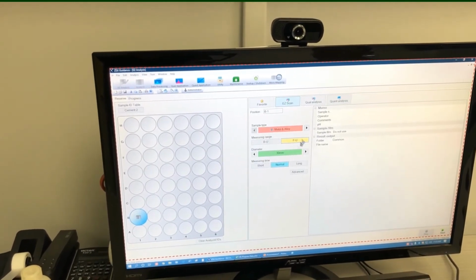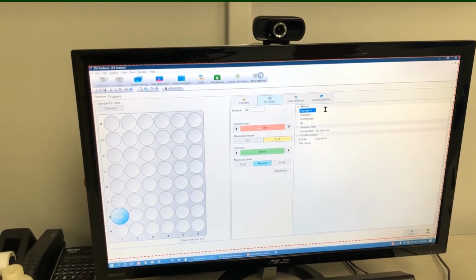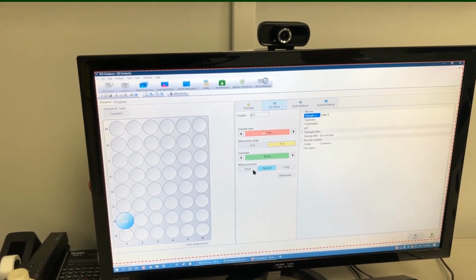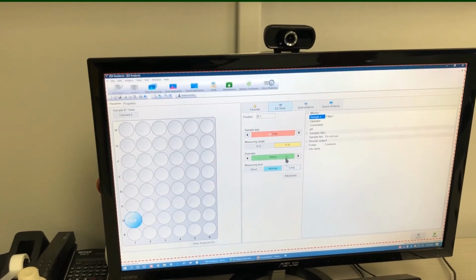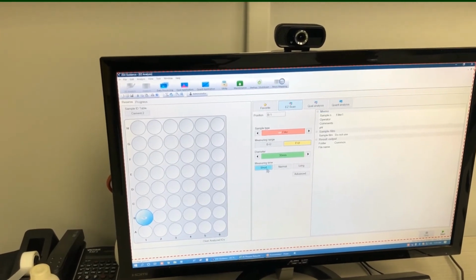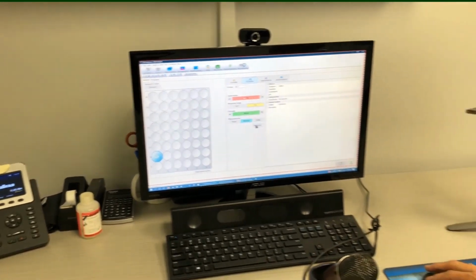We're going to go to what we call easy scan. There's actually a method on here for filters. All we have to do is put the name of the sample. I'm going to call that filter 1. We say what folder it's going to go into. And then we can analyze short, normal, or long time. You can have custom methods where we make them longer or have specific elements. But we can just do maybe a 2-minute analysis time, or a 10-minute, or a 20-minute analysis time. So it all depends on how you want to run that.